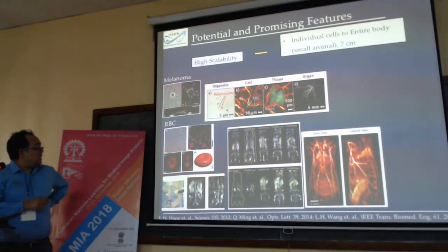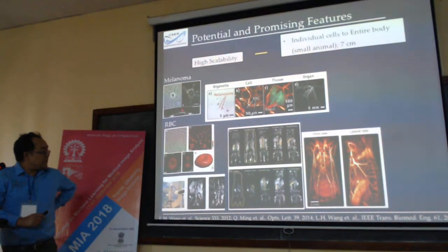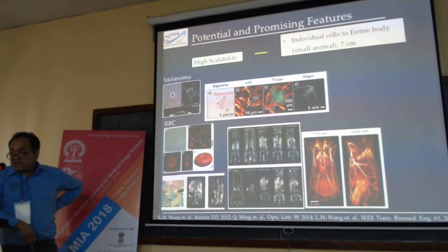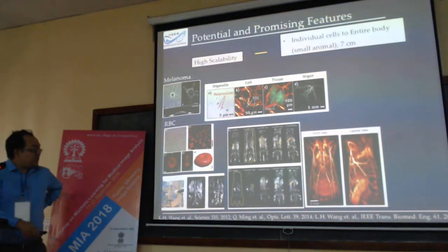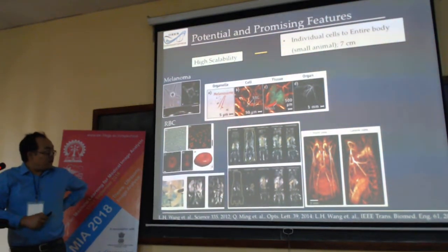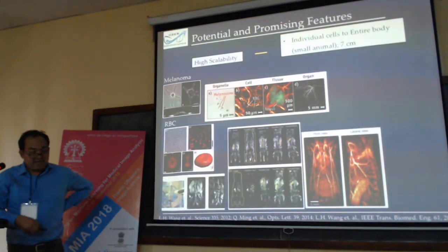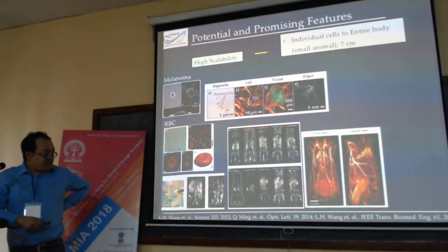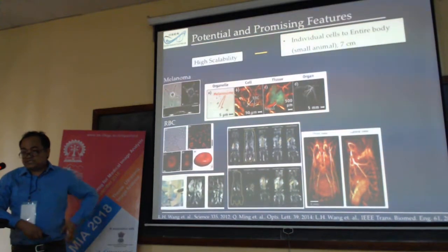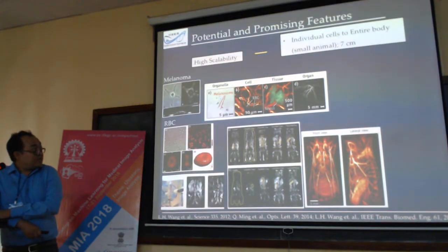So this is with the microscopy and this is with the tomography, in the sense that microscopy cannot get this kind of image, and this kind of image cannot get that kind. However, research in this domain is looking to extend the boundary of microscopy to higher penetration depth. In a similar way, tomography can achieve higher penetration depth and aim for higher resolution. This is one of the challenging problems people are looking into.